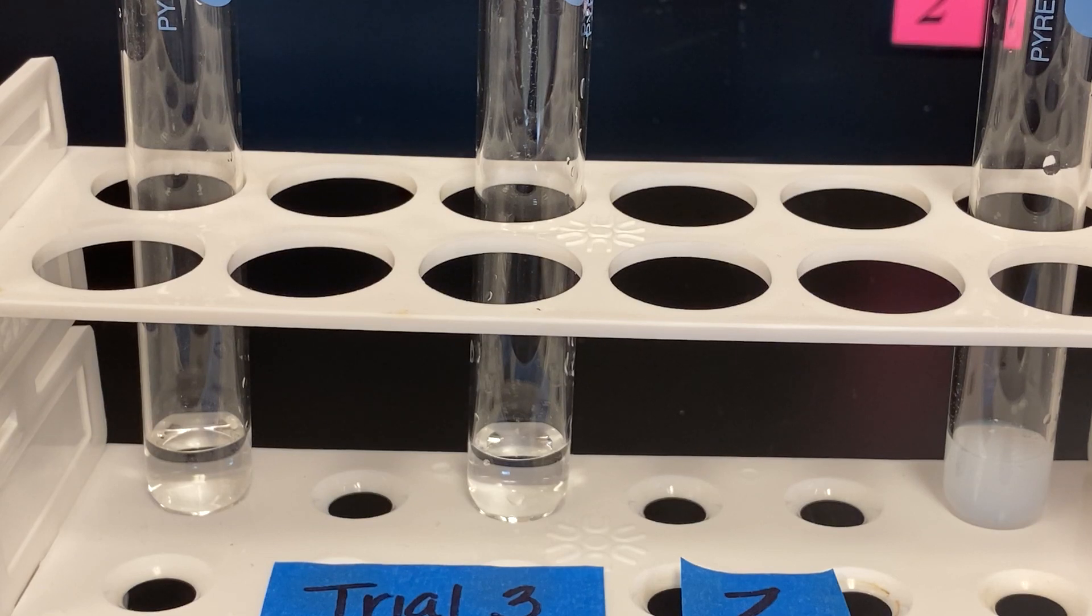Once you conduct the experiment, ensure that you are listing every step taken in each trial. For example, for trial 1, each tube was filled with 1 ml of an unknown liquid solution, X. Test tube 2 was filled with an unknown solution, X. Test tube 3 was mixed with unknown solution, X.